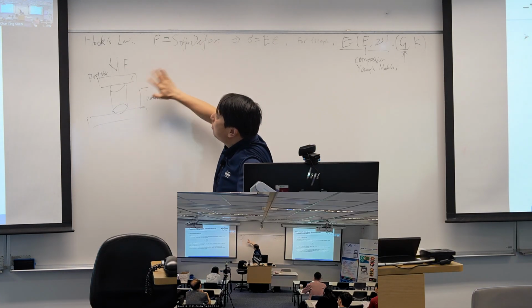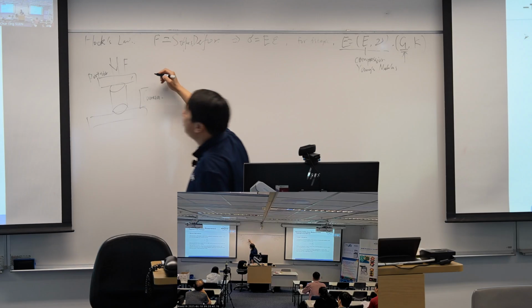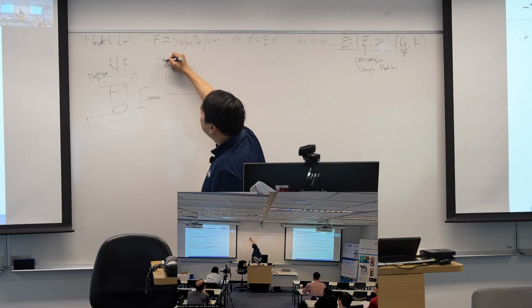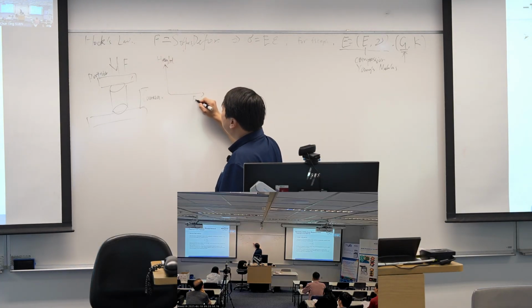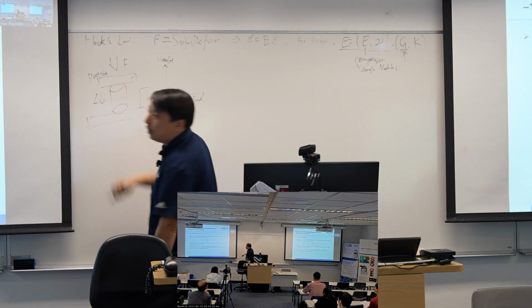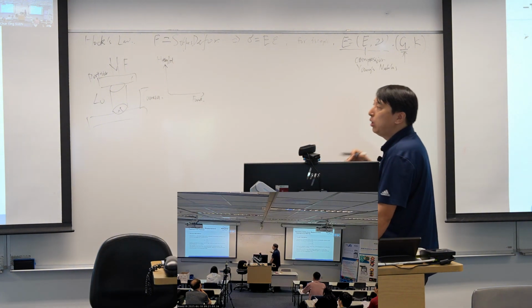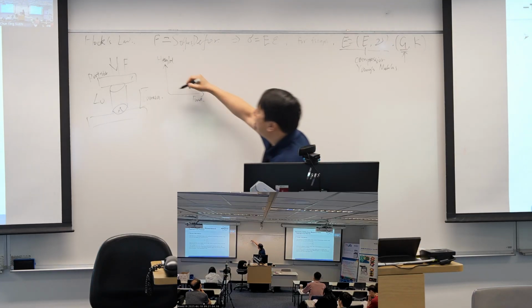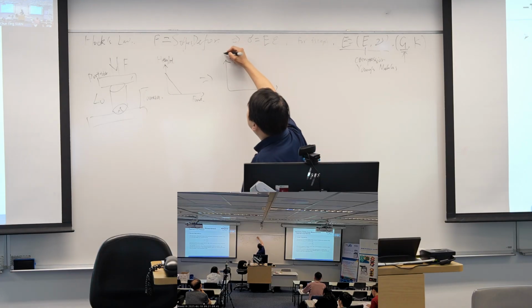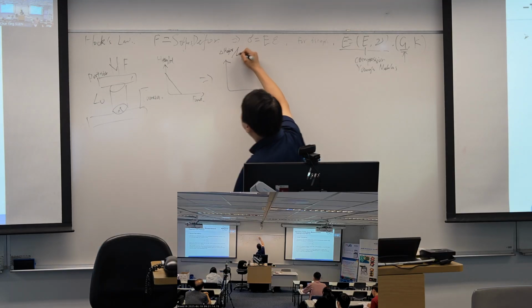Okay, and no matter how, this kind of machine presses on the sample, and as such, we can record the height change against the force we applied. And as we know the original height and the area of the cross section, we can change this curve into the height change, delta height, divided by L0.